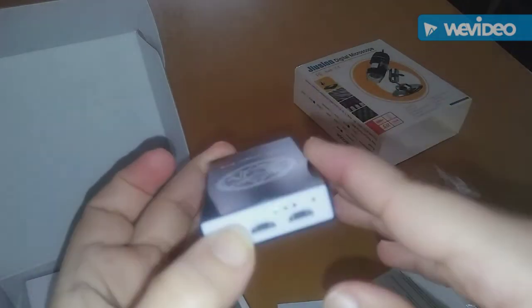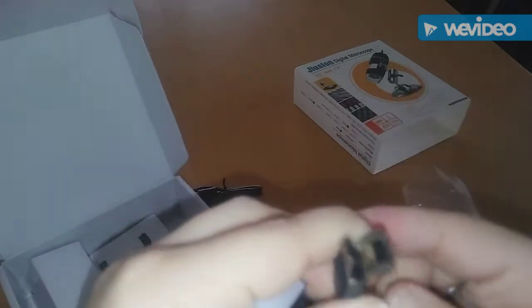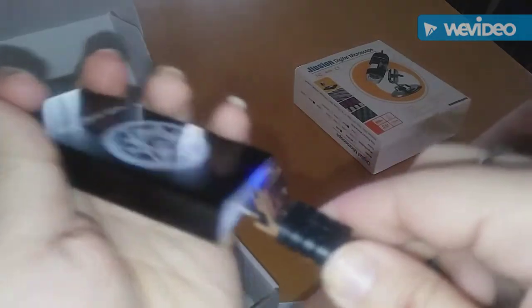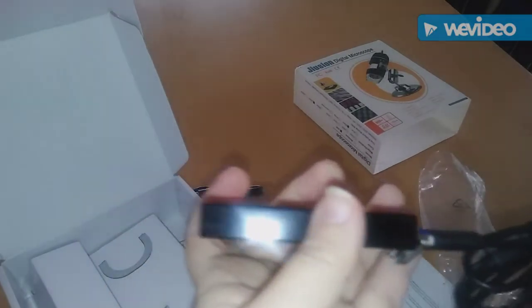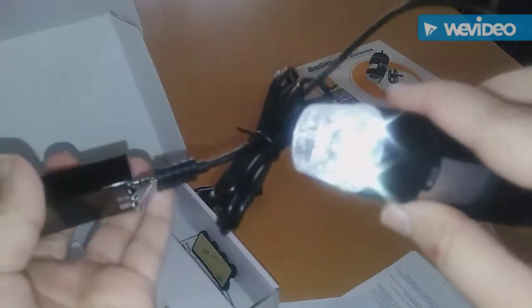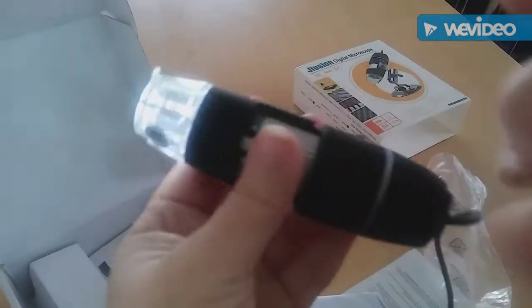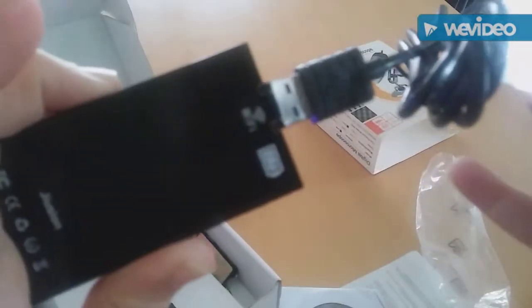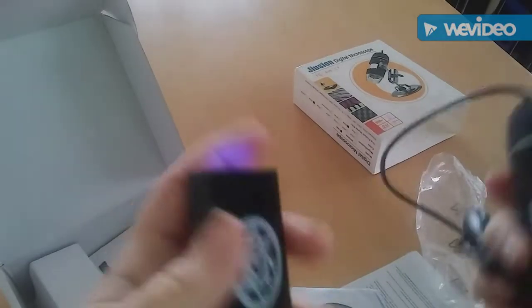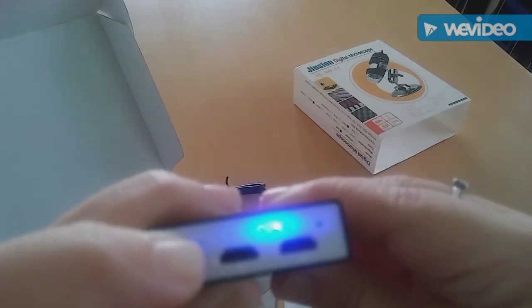So this is the box here. To turn it on, you just hold this button down and it's going to light up — see, it's green. You're going to connect this part here. You could do this — see, it says WiFi. And when you do that, it lights up. You're able to see everything through your phone — whatever it's showing on here, you're going to be able to see through your phone. Then focus it there. It's really easy to use. To turn it off, just hold it down and it's off.